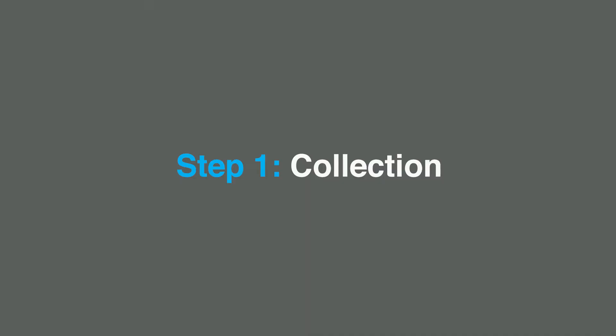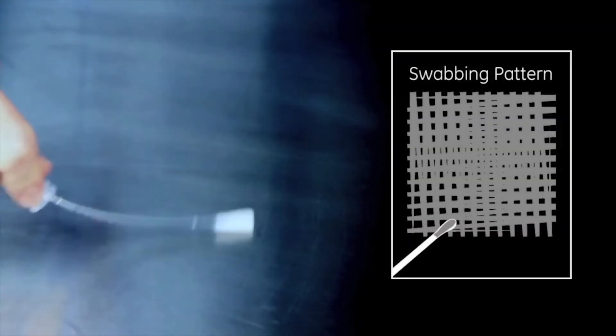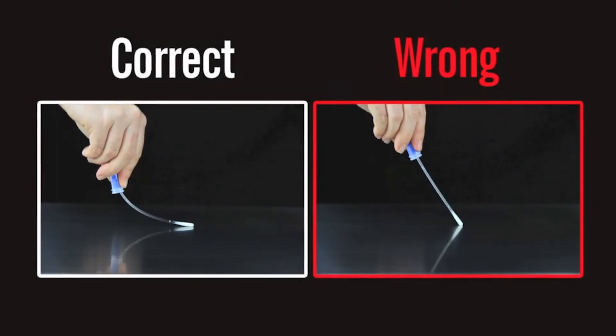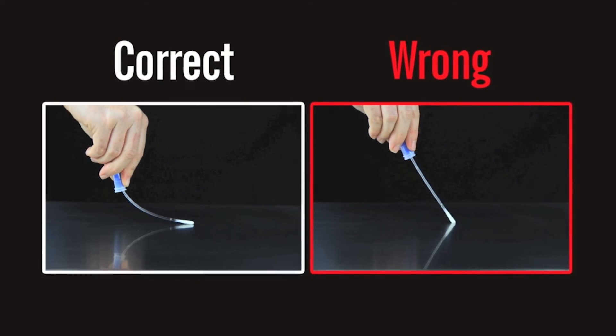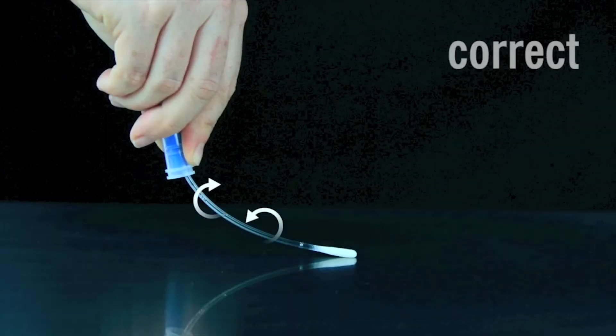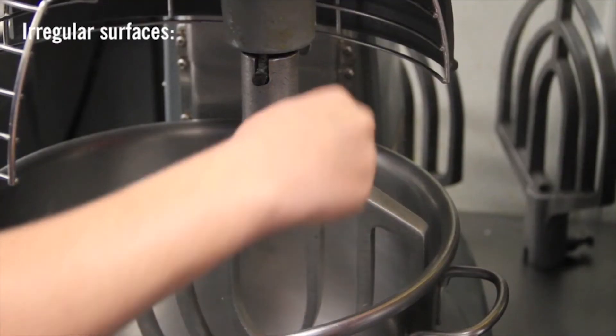Step one: sample collection. Remove the swab from the tube. When taking the sample, apply sufficient pressure to create flex in the swab shaft — this will maximize sample collection and increase the accuracy of the result. Make sure that you do not touch the shaft when collecting the sample, as we are protein and touching the shaft can contaminate the test and cause a false positive result. Rotate the swab while collecting the sample to further maximize sample collection. When collecting samples from irregular surfaces, make sure to keep the sampling method consistent and swab a large enough area to obtain a representative sample.